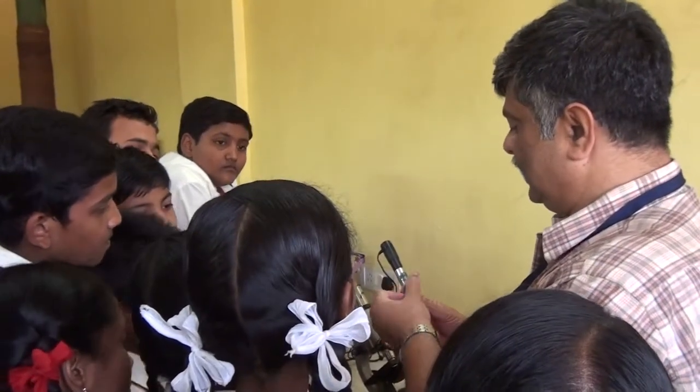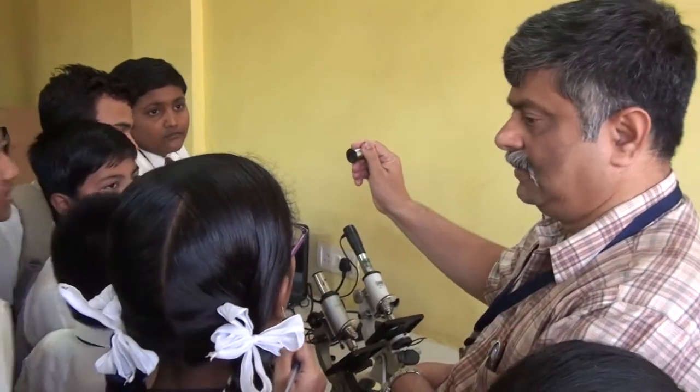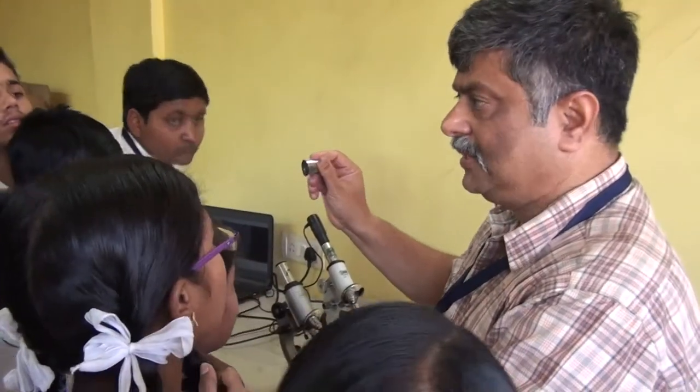Now, what is written on this lens here? What does the 10x mean? 10x.